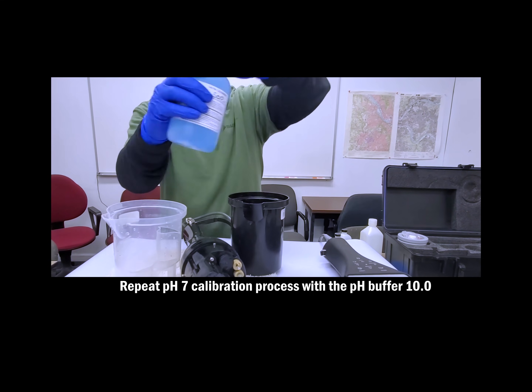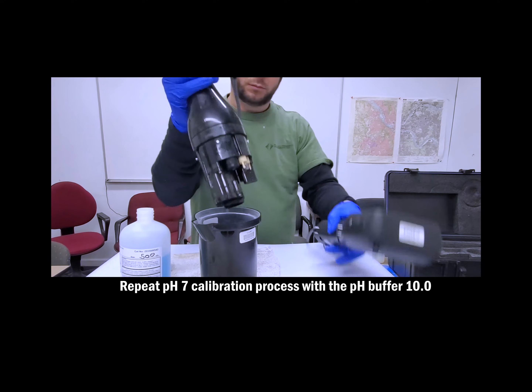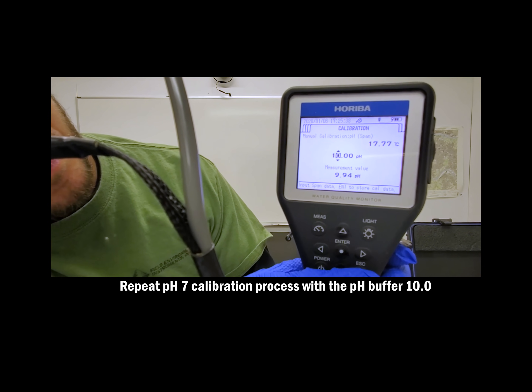For the pH 10 buffer, you're going to repeat the same exact calibration process you did with the pH 7, except the value is now 10.00.